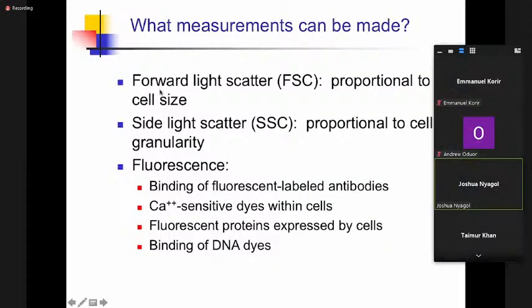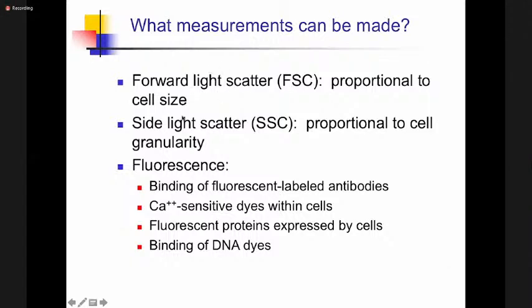And when I mentioned to you the scattering mode, there's something I've not shown you here. So you have got forward light scatter when you are analyzing your cells. Cells would more or less be scattered forwardly, or cells can be scattered sidewardly. And this is what is called forward scatter cells, or you have got the side scatter of these cells. But then all this is geared towards maybe I'm measuring the size of the cell against granularity of the cell.